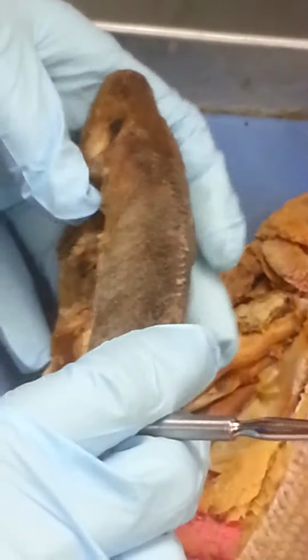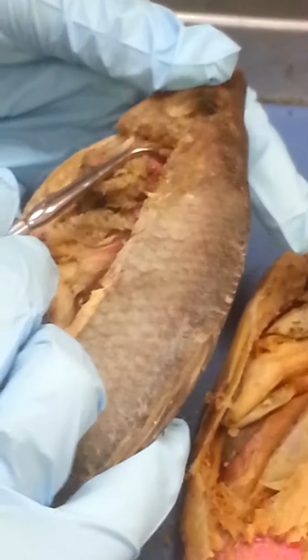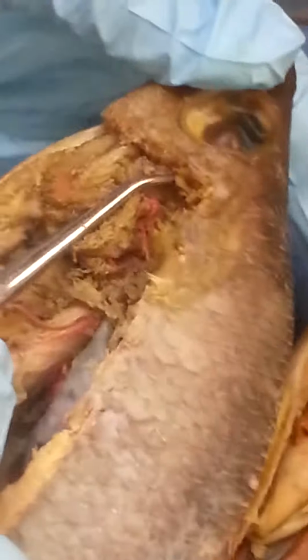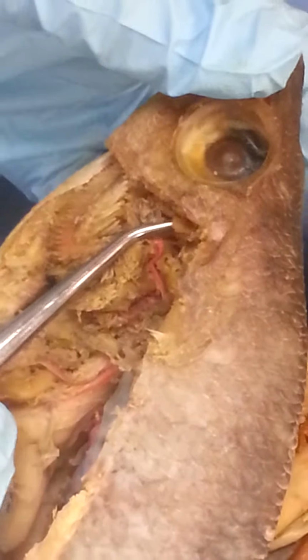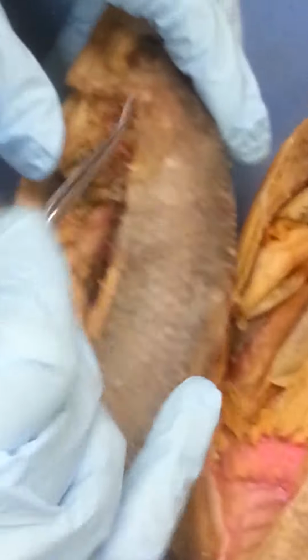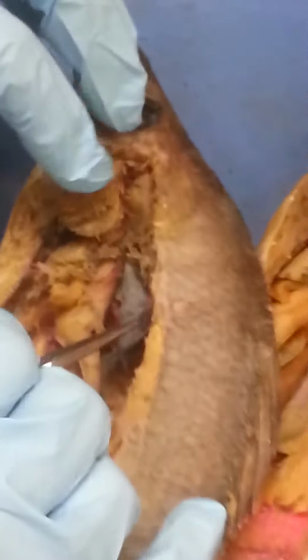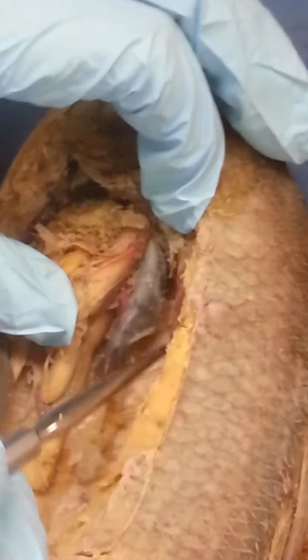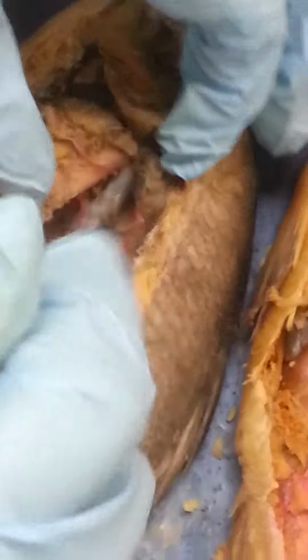All right. Then the artery, if you see it, anything going towards the head, you can kind of see that one. That's your carotid artery. Anything going towards the head, brain region, the carotid artery. Then your 2 roots of the dorsal aorta, as you can see, come together to just form a nice dorsal aorta. Okay.